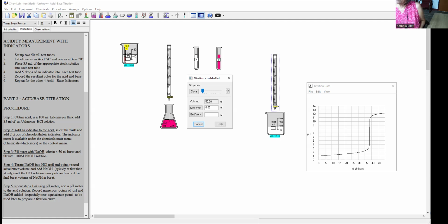And once you get the grams per liter, convert the volume from liters into milliliters, and in order to get the percentage, multiply it by 100, and you will get the percentage of acid, which means grams of acid in 100 mLs of solution. And so this is your S-shaped curve.